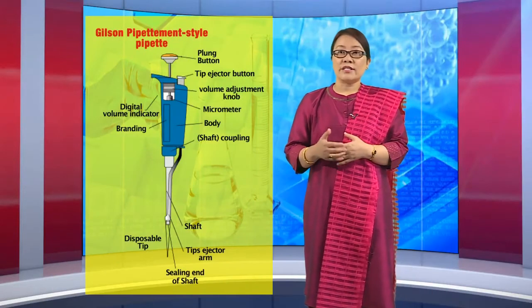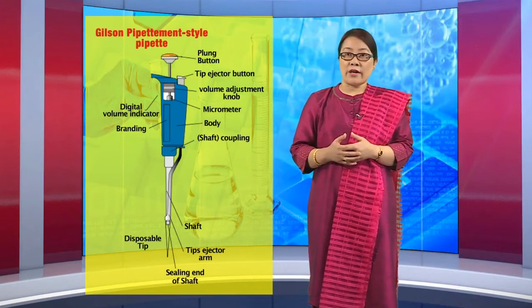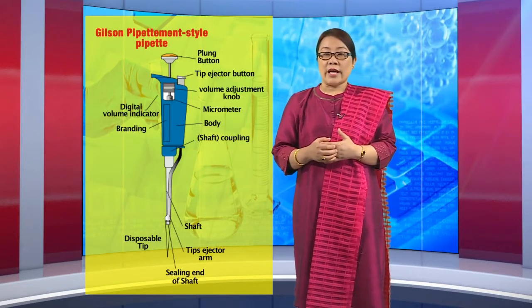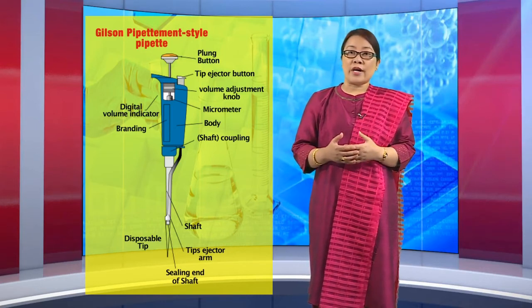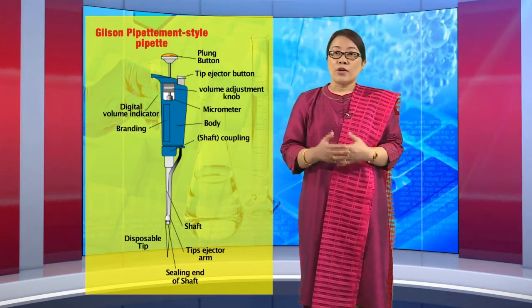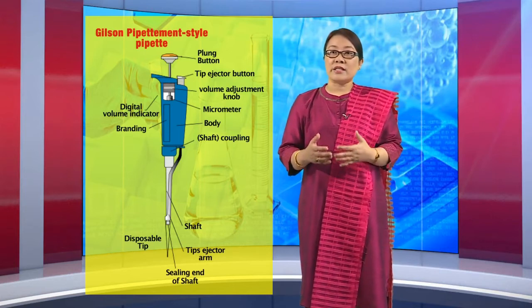When the plunger is depressed, it displaces the specified volume of air from the piston, and when the micropipette with a tip and depressed plunger is dipped into a fluid and the plunger is released, the plunger creates a vacuum and an equal volume of fluid is drawn into the tip. This withdrawn fluid in the tip can then be expelled by depressing the plunger again.